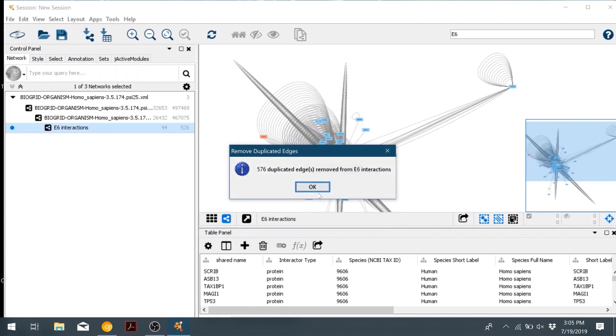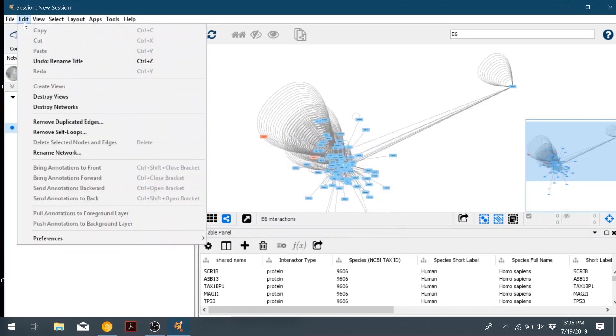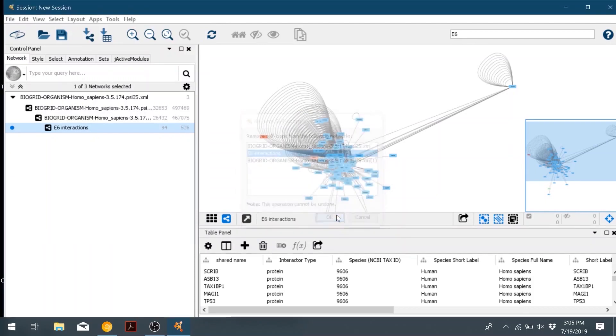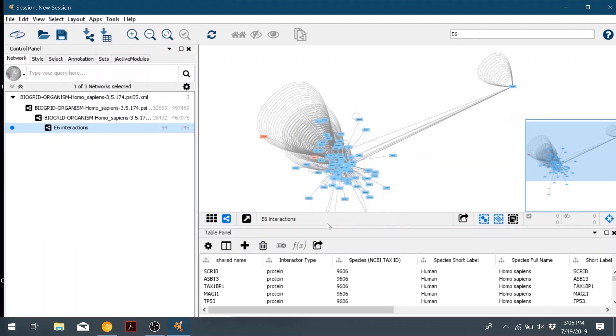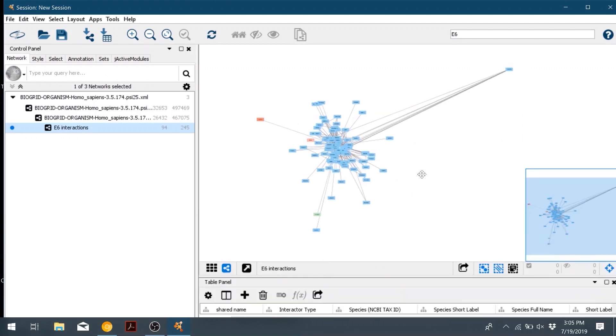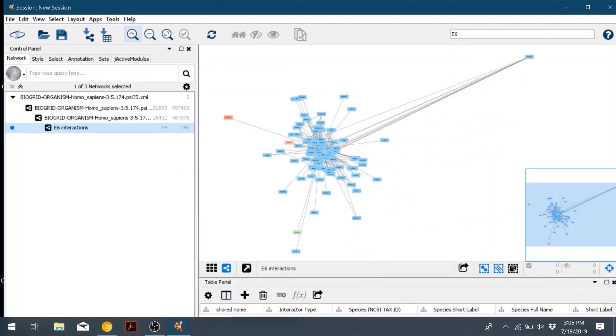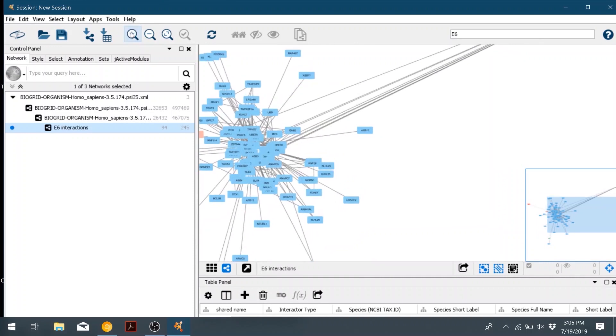And then we'll also go ahead and remove the self loops by going to edit, remove self loops, and then again select the E6 network. And then that cleans up our network a lot. However, the layout is still really messy.